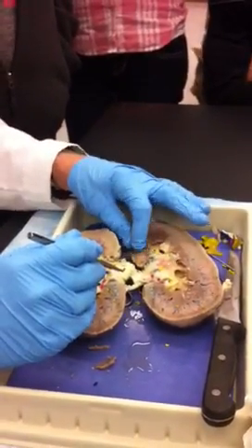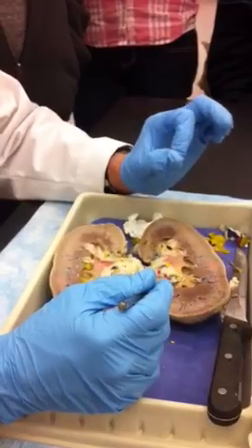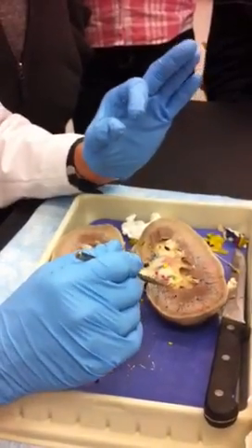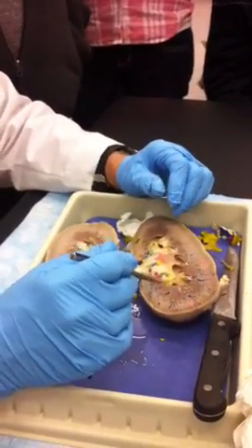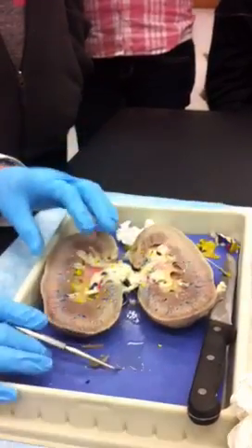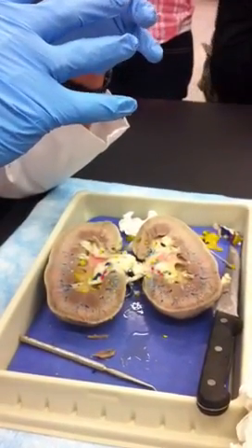It's not uncommon to find kidneys — in pigs and humans too, of course, and other animals as well — with very significant cysts in them, usually fluid-filled. We had one pig kidney with a cyst covering almost all of one side of the kidney. It's just where the nephrons and so on had died and fluid filled the area and it just enlarges into a cyst.